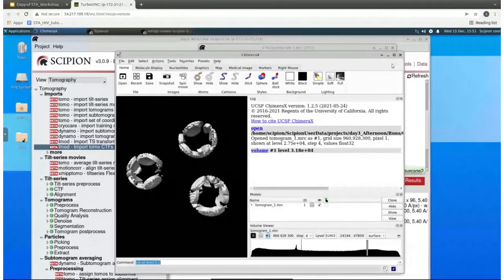In the tutorial, we also showed how we selected those viruses from Dynamo, but because of the lack of time, it is not possible to show you this here. We used the same protocol that David showed you yesterday to select with Dynamo, and we picked ellipsoidal vesicles and created the meshes, and that's how we obtained our particles. You have all this information in the tutorial.